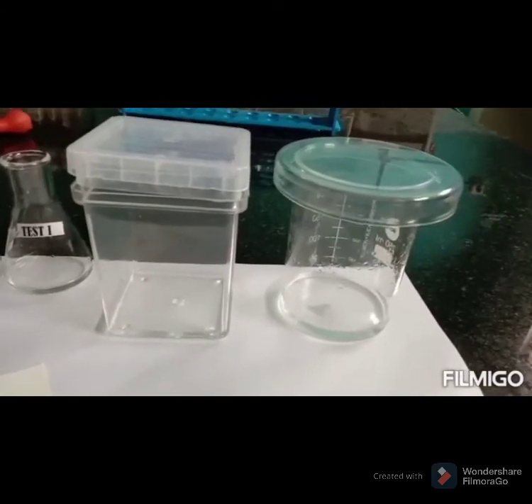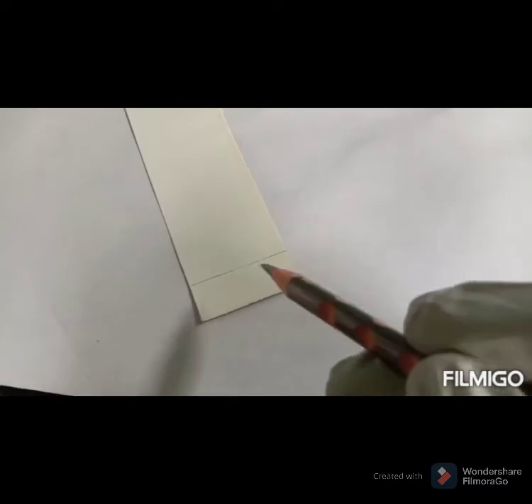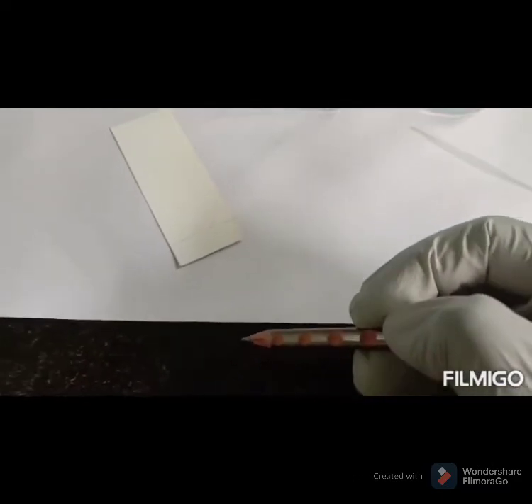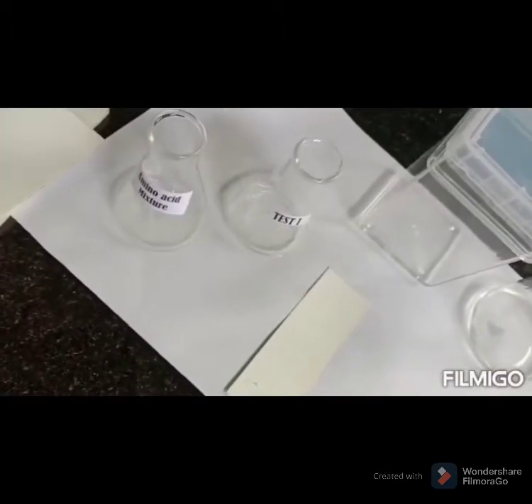To start with, draw a pencil line about 2 centimeters from one of the edges and parallel to that edge. Never use a pen for this. Two equidistant spots are also marked on this line, 2 centimeters apart, with the same pencil. The 1% amino acid solutions are used here.